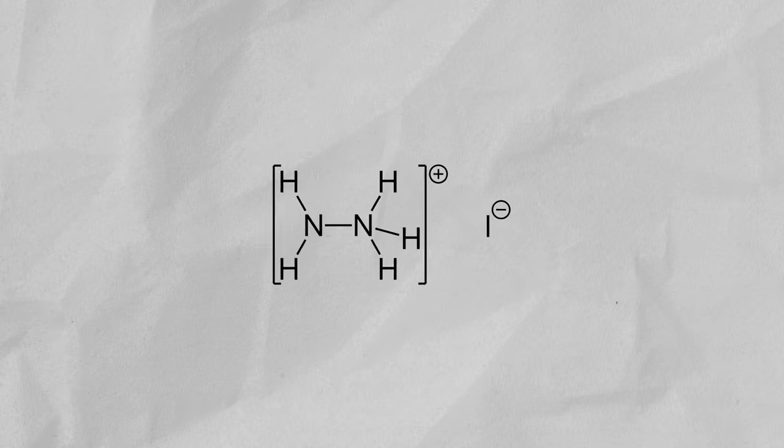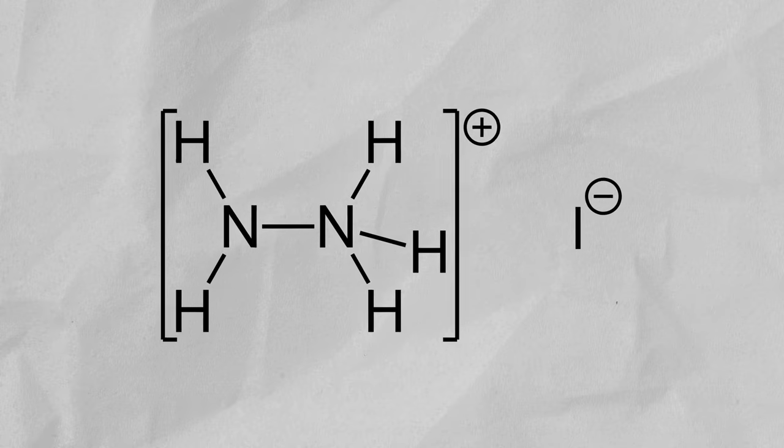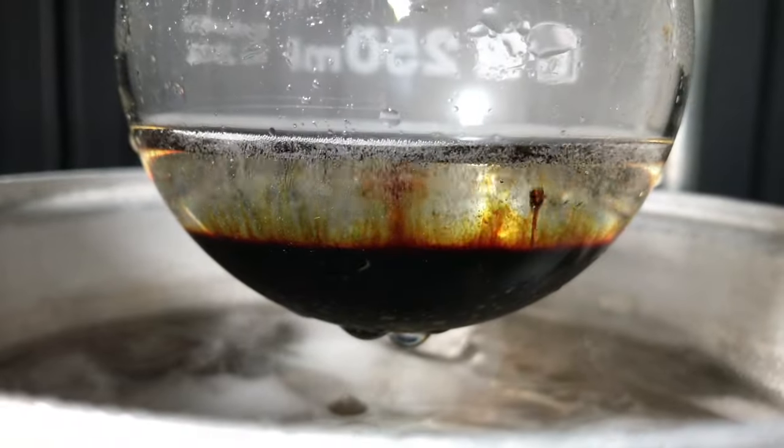Today I will show you how to make hydrazine iodide. This hydrazine salt itself is pretty useless, especially if you already have hydrazine hydrate. But watch this video anyways and I will show you an interesting intermediate reaction.